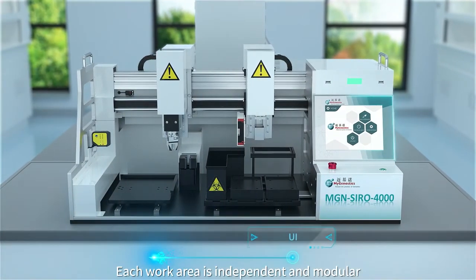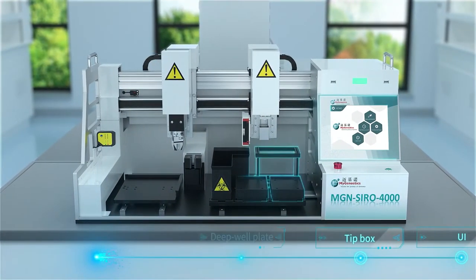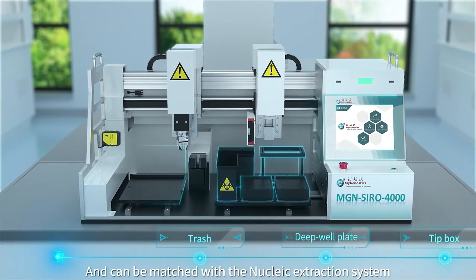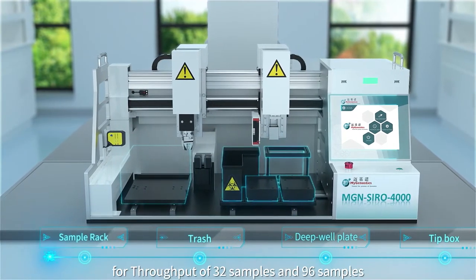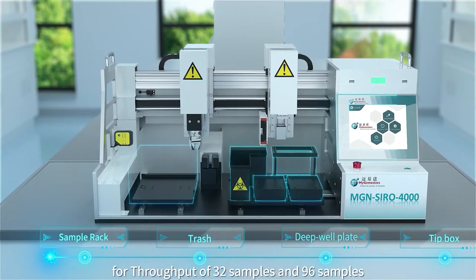Each work area is independent and modular and can be matched with the Nucleic Extraction System for throughput of 32 samples and 96 samples.